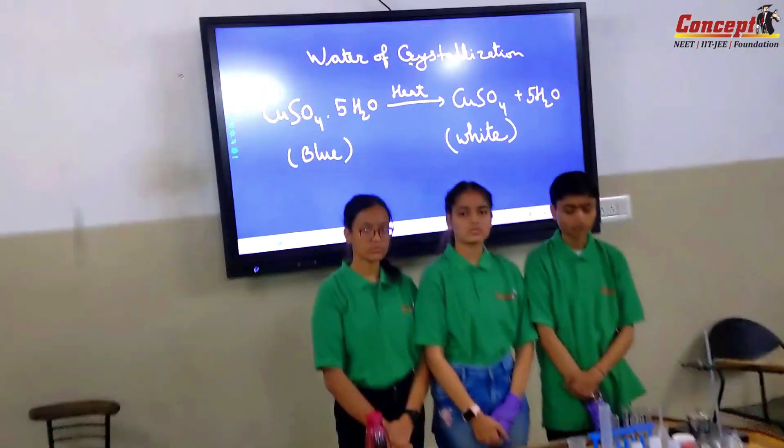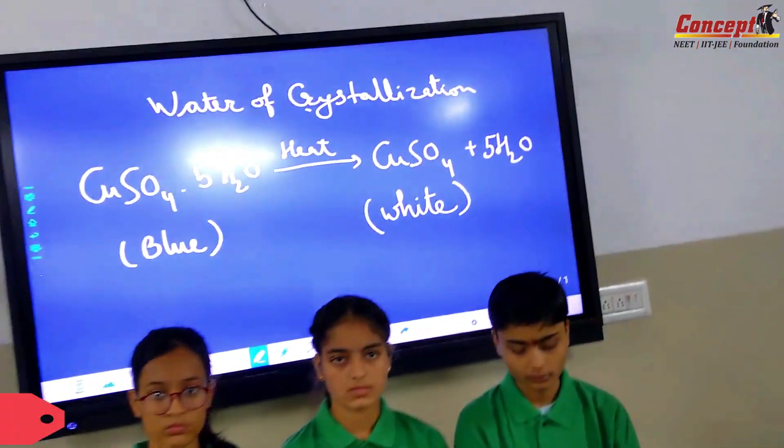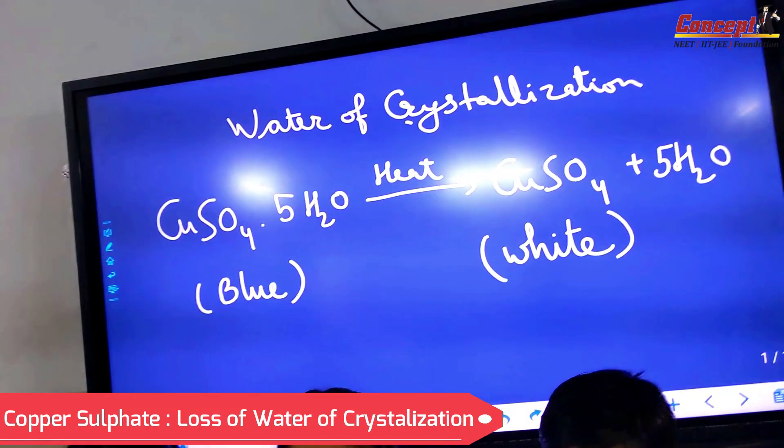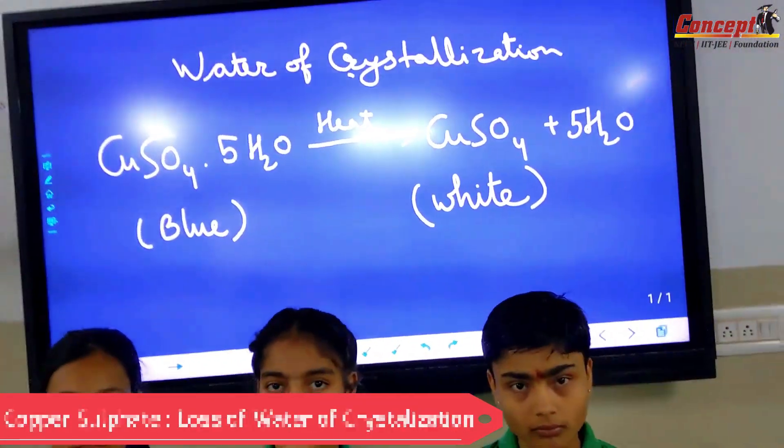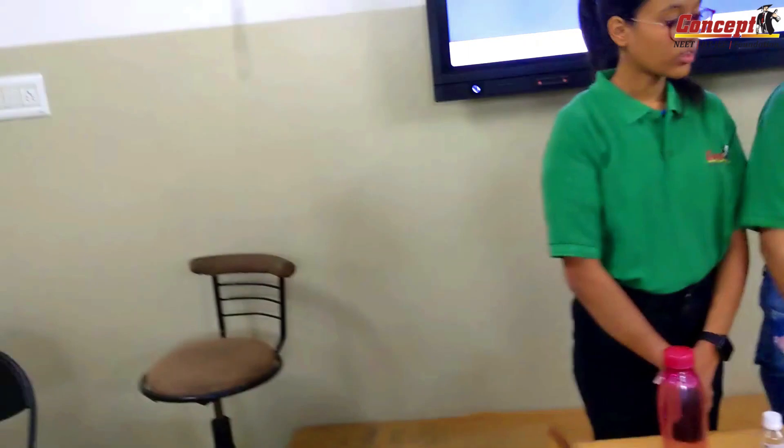In today's class we are trying to see how copper sulfate loses its water of crystallization. What happens if we heat copper sulfate? It will change into white color. Let's try to see this with the help of an experiment.